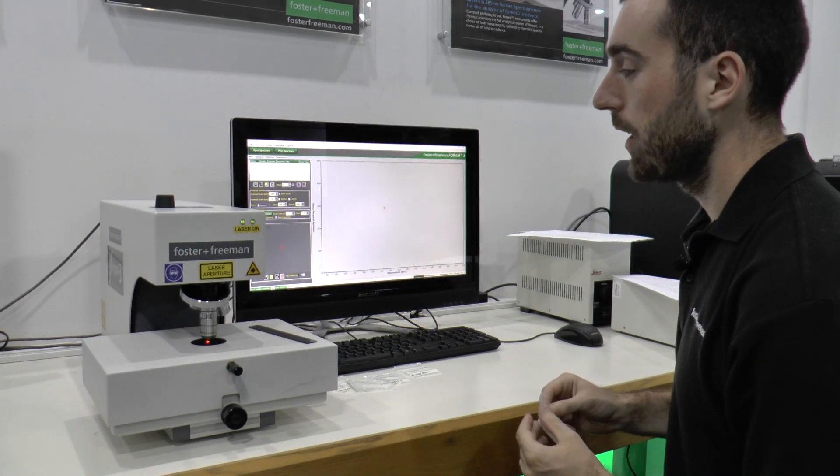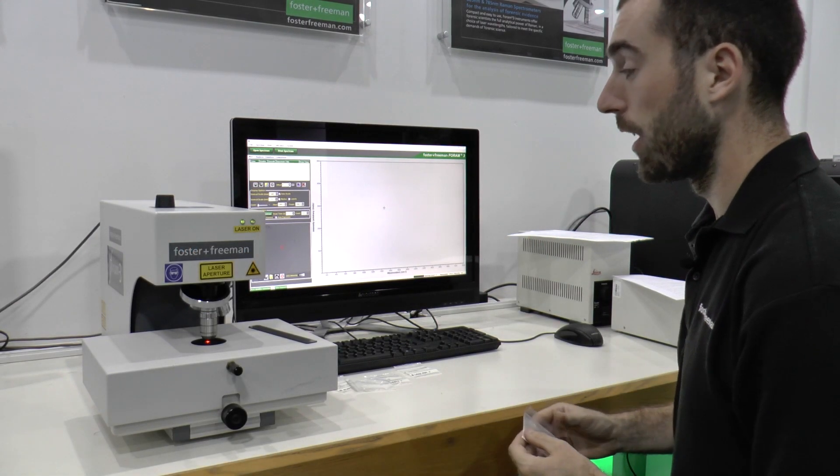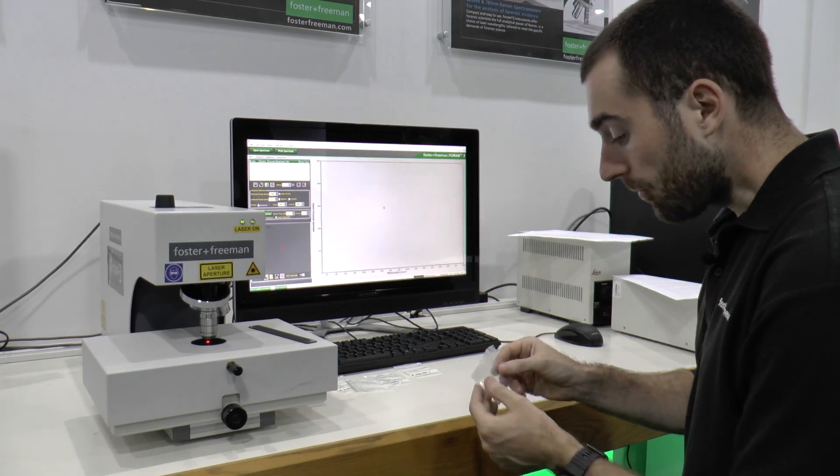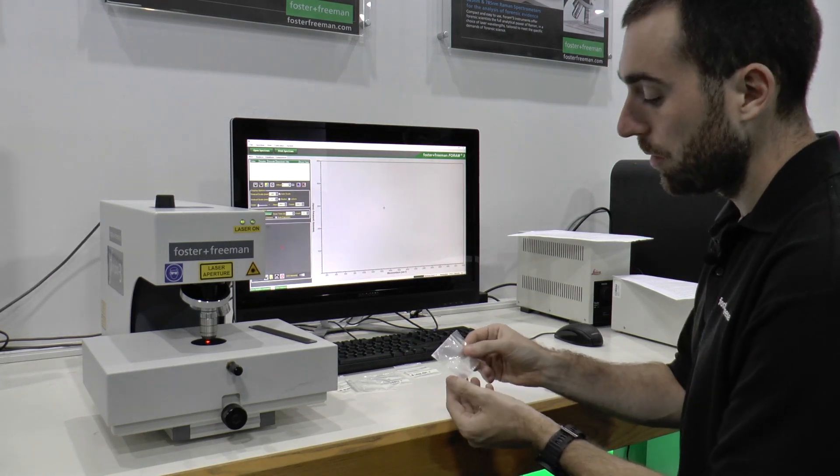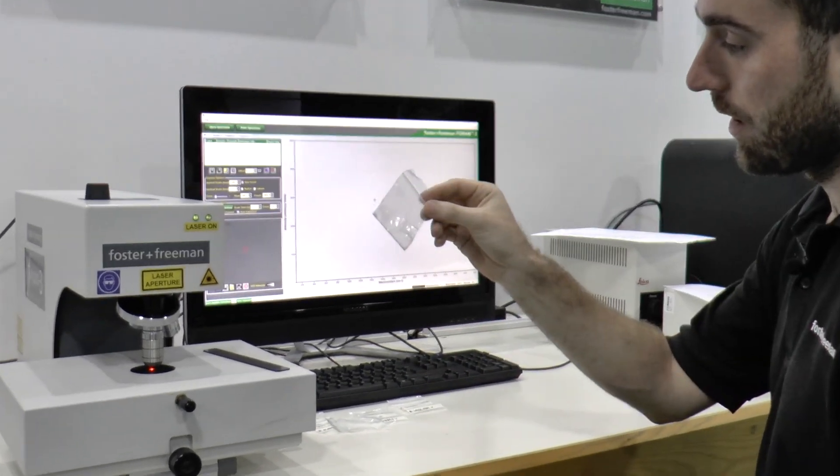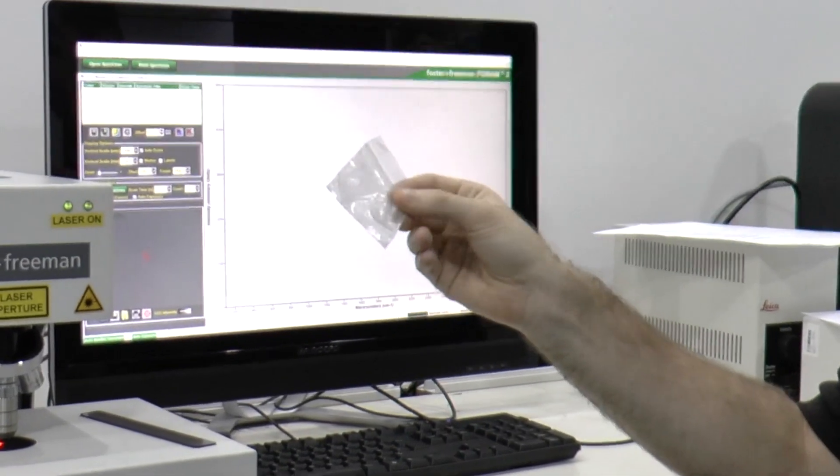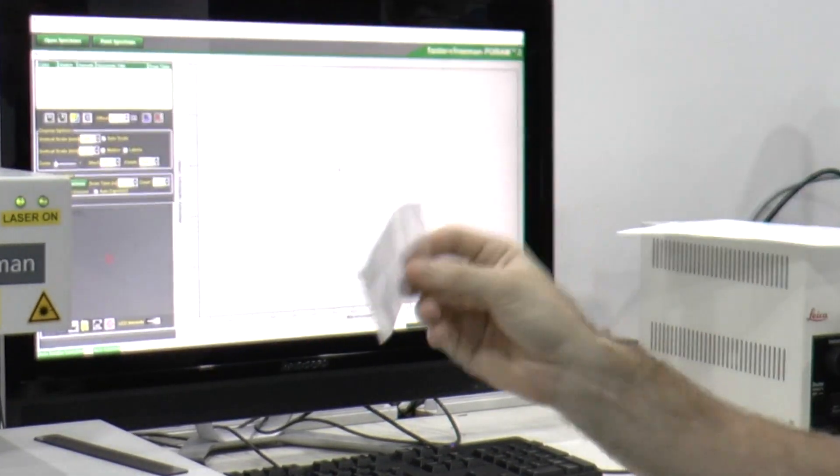Here we will demonstrate the basic workflow of the FORAM. Our sample this time is this container or bag of an unknown white powder.